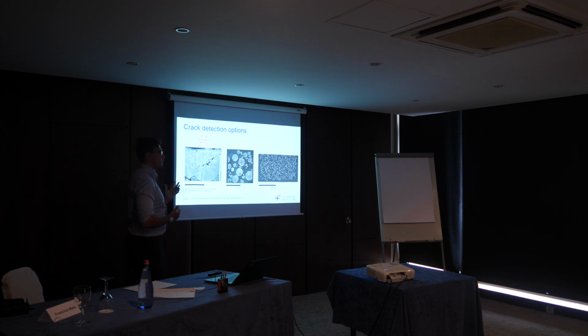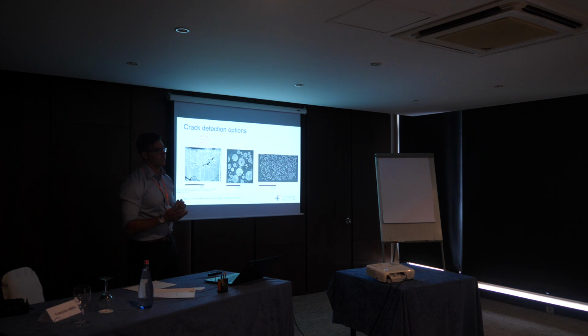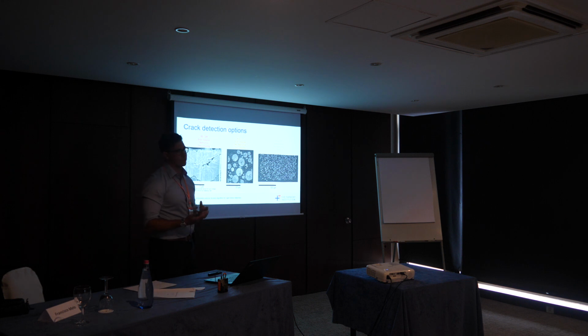Then we have nano-CT, like the images I showed at the beginning. This is pretty good resolution, you can still see the cracks, and it's non-destructive, which is nice, but it's still time-consuming, so an image can take 24 to 48 hours. Or we have micro-CT, where the resolution is good but not great, so you might be able to see some cracks, but you might have to infer the presence of others. It's non-destructive and fairly rapid, so some of the scans I'm going to present can be done in the lab in 4 hours, or even quicker if you get to a synchrotron, and you can get thousands of particles per day rather than your 50 or so.